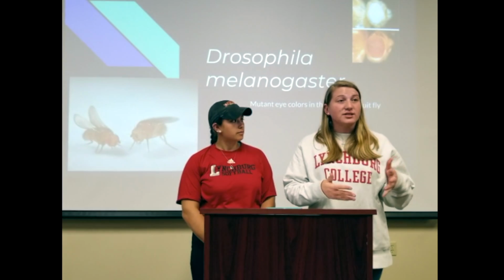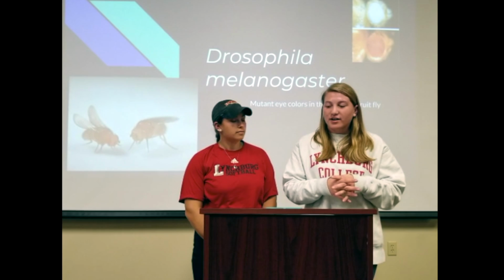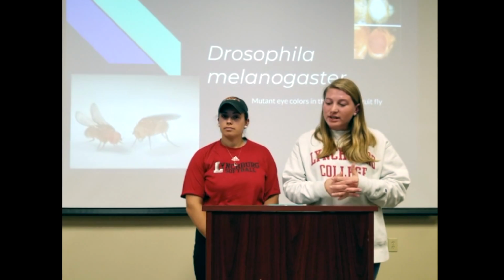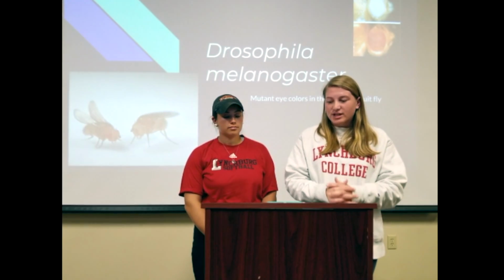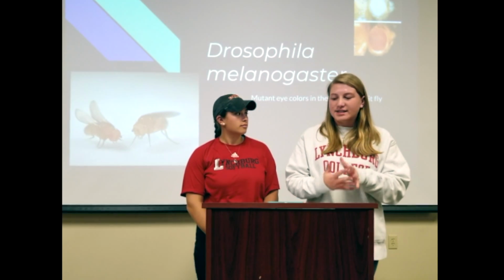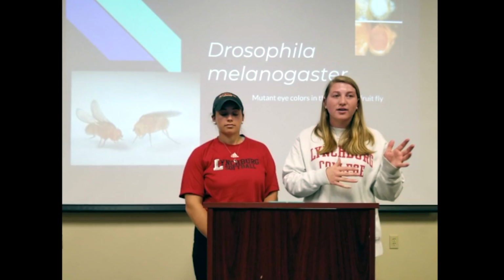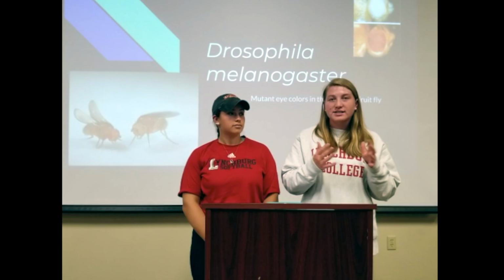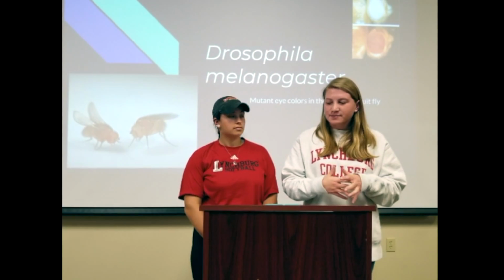And speaking of mutations, there are actually multiple mutations in the common fruit fly for their eye color, but primarily what we're going to focus on is the white and the sepia eye mutation. The wild type eye color is actually red, and two of the mutations that are very common are white and sepia eyes, and our focus today is sepia eyes.